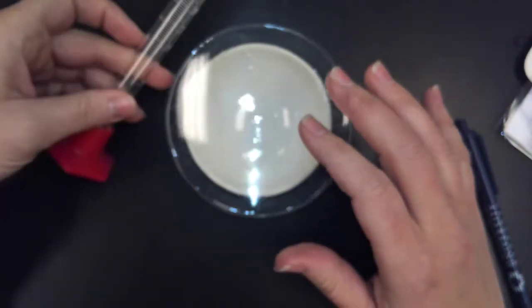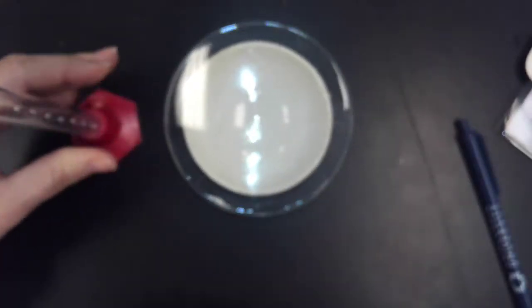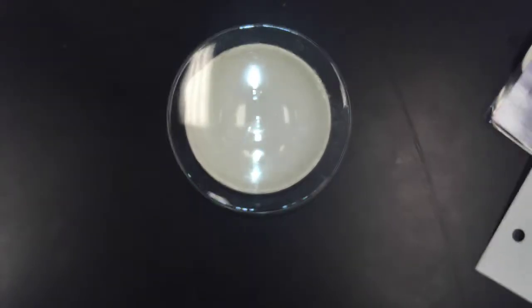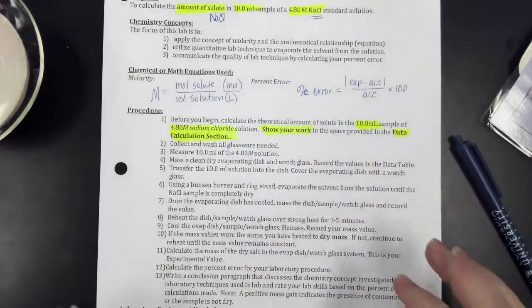Also, I will want a 10 milliliter graduated cylinder. So make sure you're grabbing a 10 milliliter graduated cylinder and not a 50. So collect and wash all glassware needed. Then measure out 10.0 milliliters of the 4.80 molar solution.